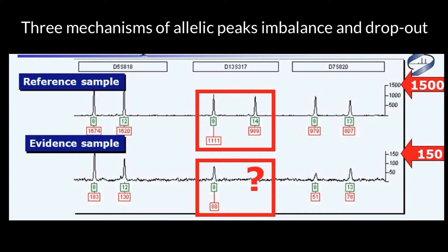And first of all, I want you to pay attention to this reference ladder that represents relative fluorescent units. And now you would see that here those peaks are almost like the same in size, but actually this peak is about 10 times bigger than on the lower electropherogram. Here we have 1500 relative fluorescent units, but here we have 150 relative fluorescent units.